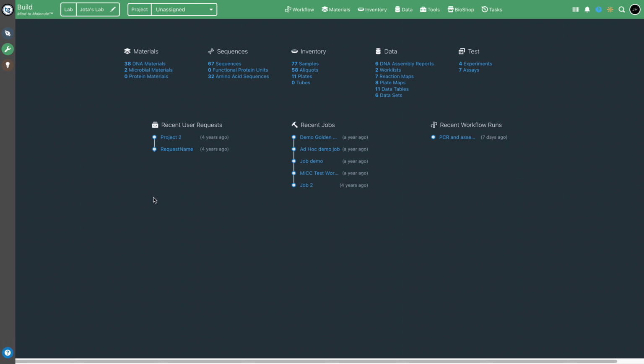So you can use it as a standalone platform, but also you can use it in conjunction with the design module and the discover module. So I'm going to start showing the basics of the build module, and then I'm gonna go into more details on some specifics, interesting parts. But have in mind that this is a general overview. There's a bunch more that can be done, but the idea is that you can have a general idea of how this works.